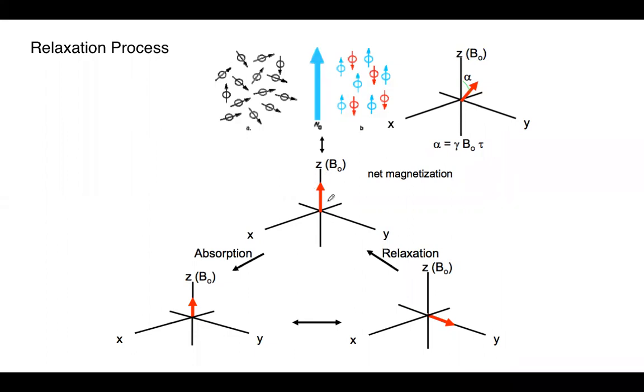Here we have the dipole moment of our molecule. Basically what we've done is we've taken these and we've put them here. They could have really any direction. It doesn't have to be perfectly aligned, just so long as it's in the general correct direction. I realize now that red is the color of those oppositely aligned, but hopefully you get the idea. This red arrow is aligned with the magnetic field.